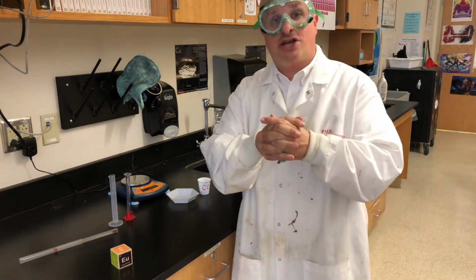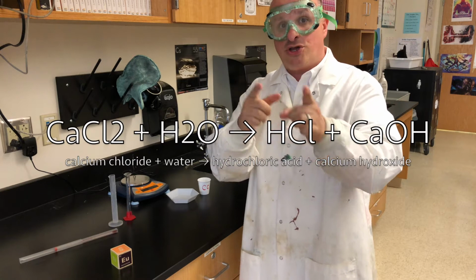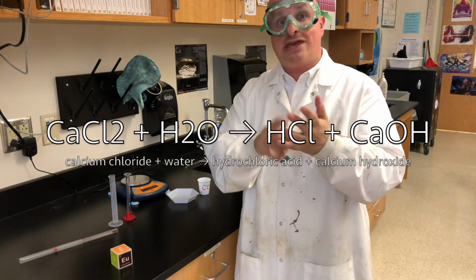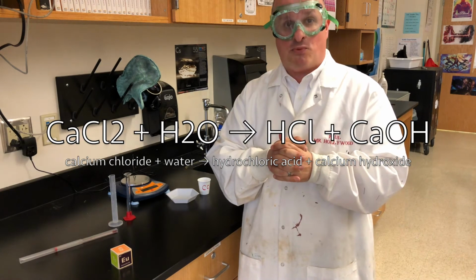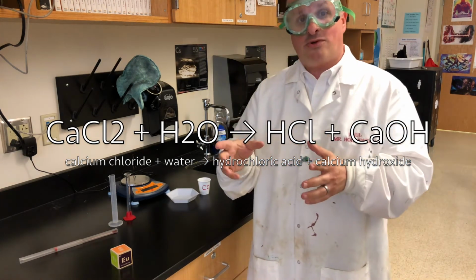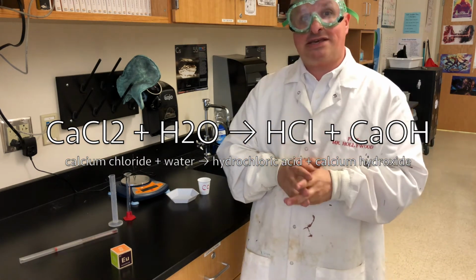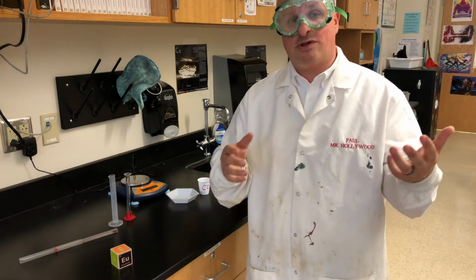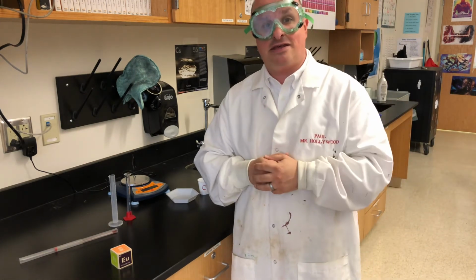So what is today's reaction? Well, remember reactants and products. Today's reactants are on your screen right now. They include calcium chloride, which is a chemical that's sold in stores as Damp Rid because it absorbs humidity from the air. Calcium chloride, and then the other reactant is water. And as you can see, when they mix together, they create some substances that we don't really care about. But the big thing is they release heat into the environment. That means the temperature is going to go up.